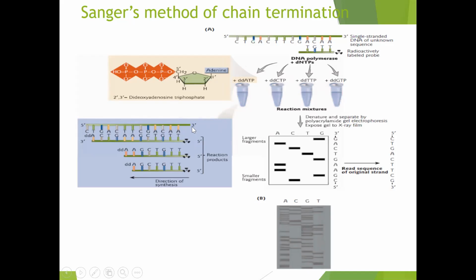So here, in one reaction, how the reaction products are formed is elaborated. Yesterday there was a little confusion about how many G's, how many C's and so on. Actually, the point I missed explaining is that here the primer is attaching. So leaving this portion, we have to consider the sequence from here.